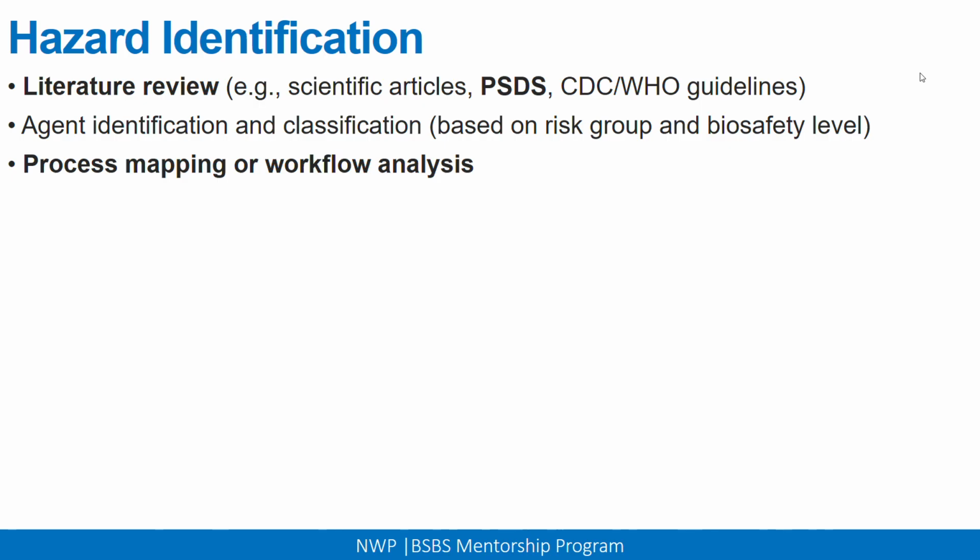The best way to know at which point you can get exposed to hepatitis while doing your testing is to map out the process of testing for hepatitis. So what is the procedure of actually testing, or what procedure are you using? You then map out the process from the time the samples are collected for testing up to the results release of hepatitis.